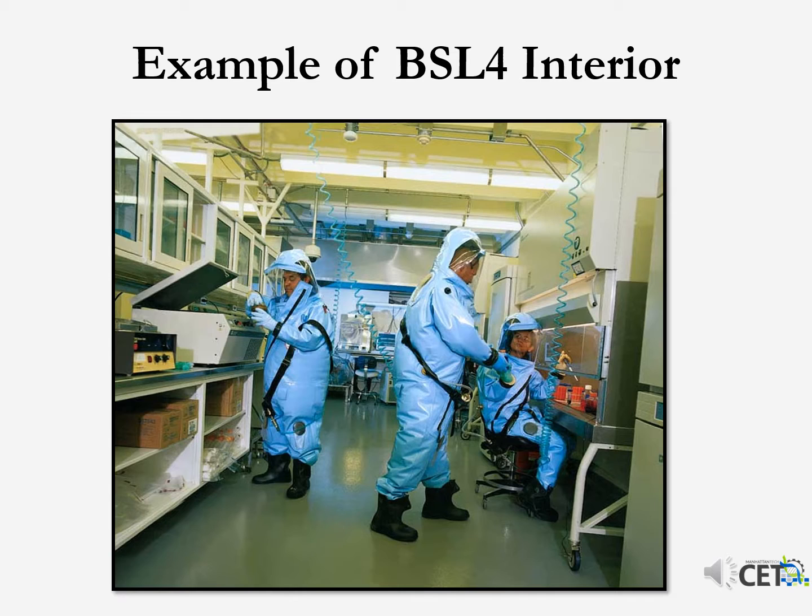These uniforms they're wearing are all sealed. They are airtight. All the air that they have comes in and goes out there. It is impermeable to liquids. So these people are wearing extra safety protection, and they're practicing extra safety procedures. The mechanical features and the design features of these labs are increased.